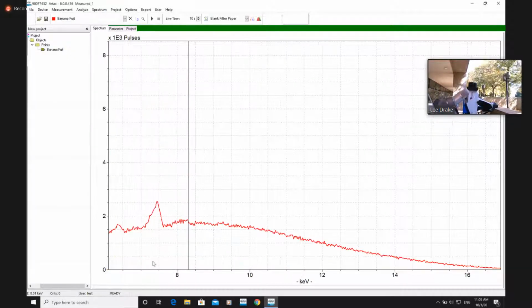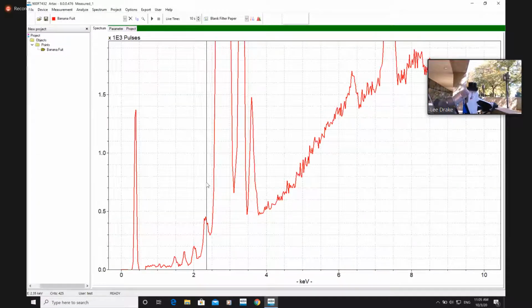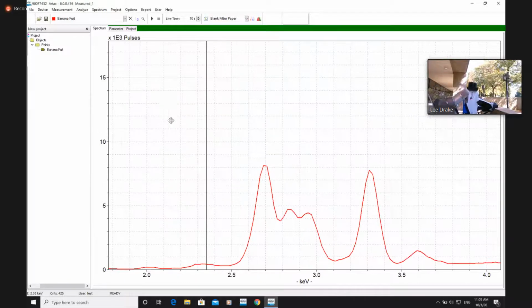So here is our spectrum. Now, every peak you see here is a different element that is present, each color. The only exception is, now real quick, can you guys see my mouse when I move it around? So this peak right here, this really big one near 0, this is one that Bruker adds to its spectrometer that basically spikes it to help calibrate it. You won't see this if you're using an Innov-X or a Niton instrument or an Elio.